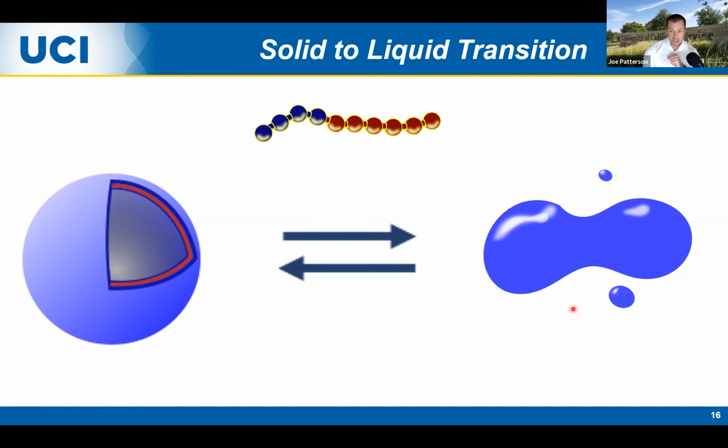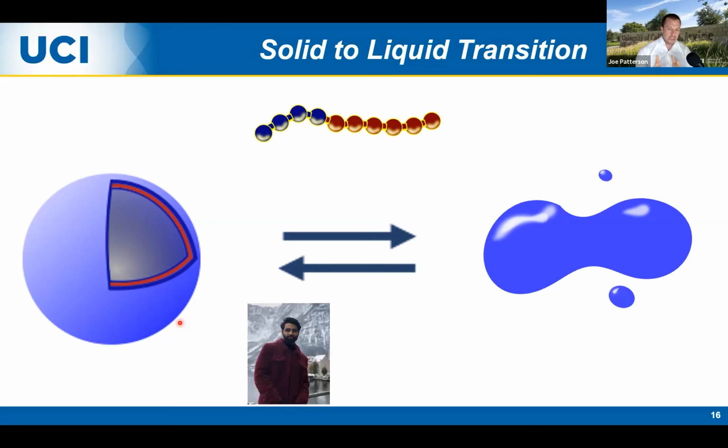But what we found for these liquid phase materials is they actually act more like a sponge. They kind of suck up really any molecule. And we've shown in our lab now that these will suck up lots of drug molecules. And we believe that we can use these and then convert them into the solid phase material, which we can then use for drug delivery systems. So this is the project that Arne's really established and what he's working on in the future.